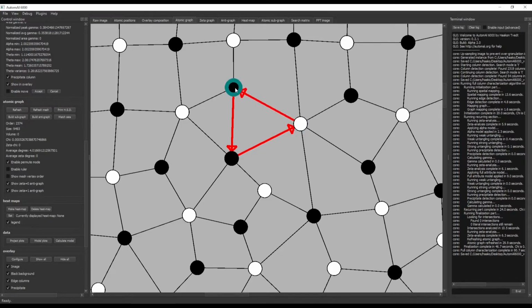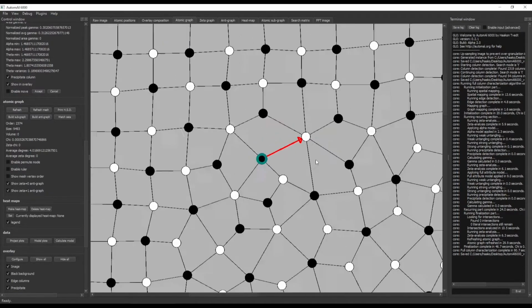And now you saw I changed the species to silicon, which means that it lost an arc, but it lost the wrong one. It should have lost this one. We don't know the order in which it has arranged its neighbors, so we would have to correct that, same as usual, like that. And this arc, in my opinion, should just stay as it is to indicate that this is a deviation from the principles.